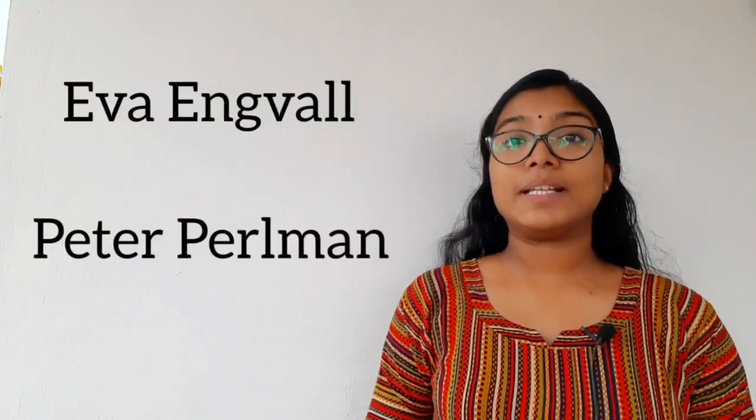So what is ELISA? ELISA is an immunological assay commonly used to measure antibodies, antigens, proteins, and glycoproteins in biological samples. ELISA was first described by Eva Engvall and Peter Perlmann in 1971. So what is the principle of ELISA? ELISA works on the principle that specific antibodies bind the target antigen and detect the presence and quantity of the antigen.